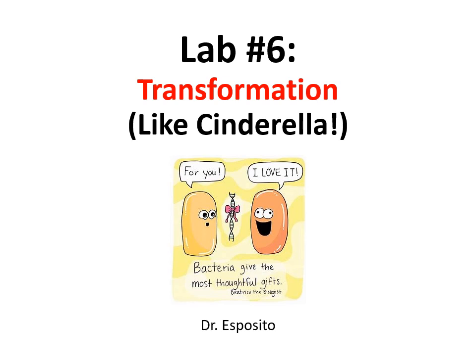Everyone, and welcome to lab number 6, which focuses on transformation, which I know sounds like something very mystical and fairy tale-like. But in reality, transformation is one of the main forms of gene transfer possible with microbial cells. For instance, when we say gene transfer, we mean getting new DNA into these little valuable bacteria to help us out, okay? So we're going to go through what exactly gene transfer means, and then we'll go through the experiment of transformation.